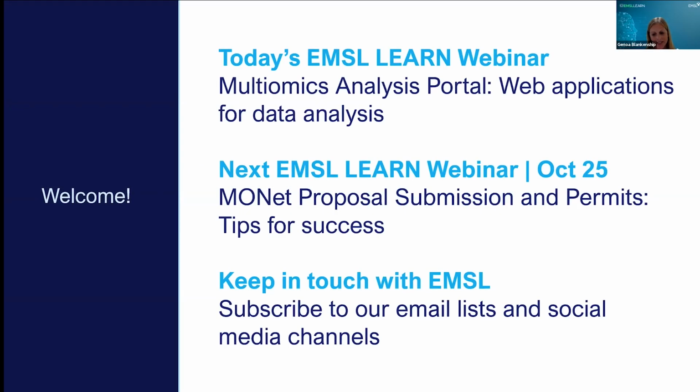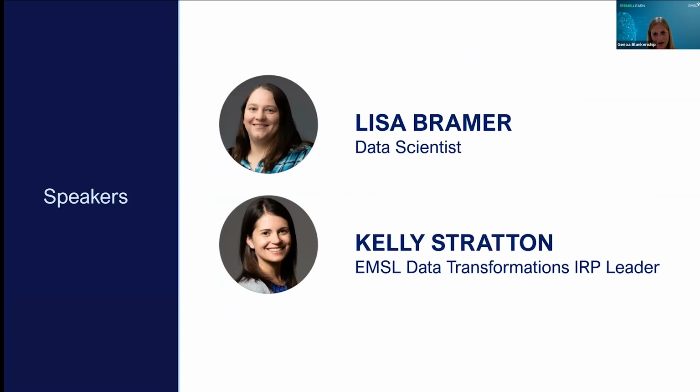Today, our presenters, Lisa Bramer and Kelly Stratton, are here to introduce the Multiomics Analysis Portal, or MAP, which is a one-stop omics data analysis web portal for EMSL users. It can perform quality control, exploratory data analysis, visualization, statistical analysis, and data integration. They'll go over the types of omics data that MAP accepts, what the different tools within MAP can do, and additions coming to MAP later this year.